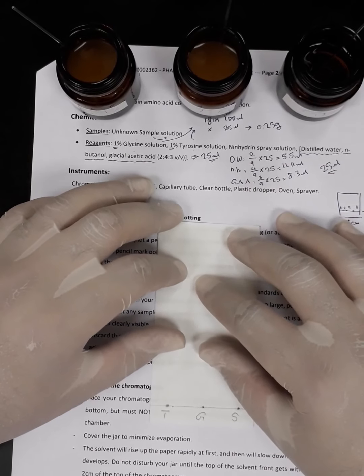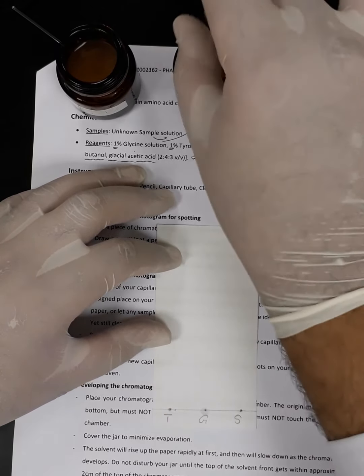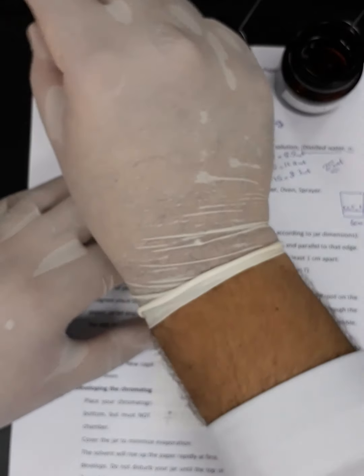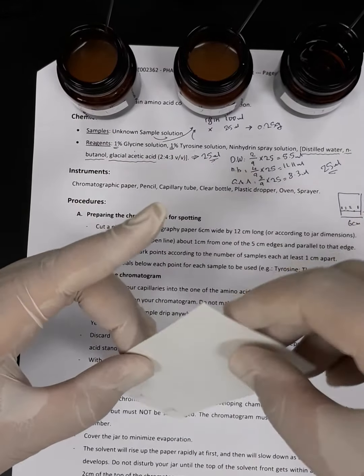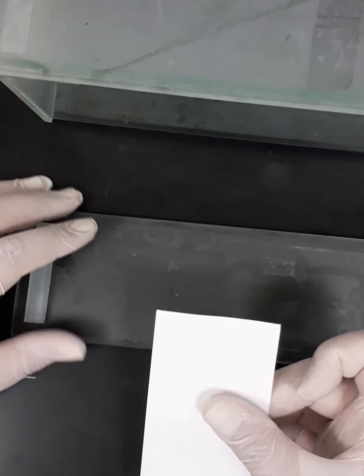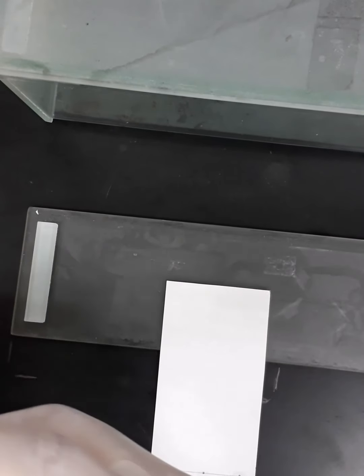And now I'm going to reload the spots again. So once again the glycine, I have to spot it on the glycine, and the tyrosine, I have to spot it here, and the sample I have to load it here. Now I'm going to dry it again. Now I'm going to use the cover to fix the chromatographic paper or the chromatogram on the lower part of that cover using the tape.